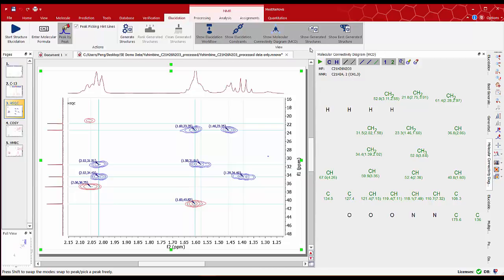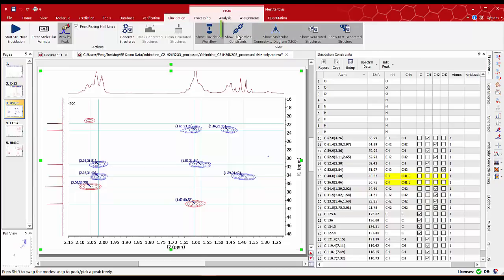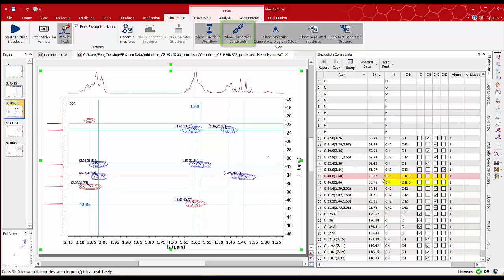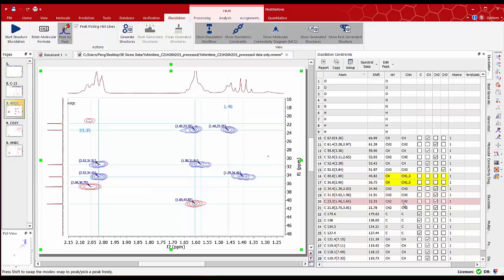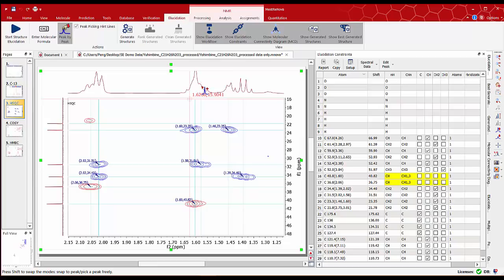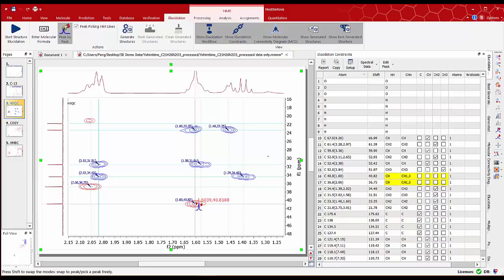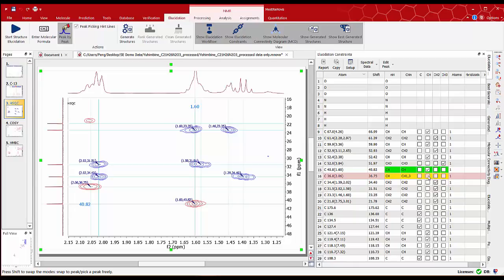So we can go to the elucidation constraints table. We see the rows highlighted in yellow signifying that there is no conclusion from automatic analysis for these groups and we have to resolve these manually. From the integral value for this group which is around 3 we can see that this cannot be a CH3 group. So we can edit the constraints table ticking the CH checkbox for row. In this way row 15 turns green.